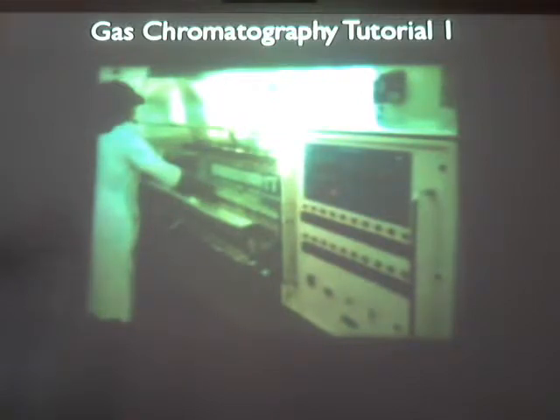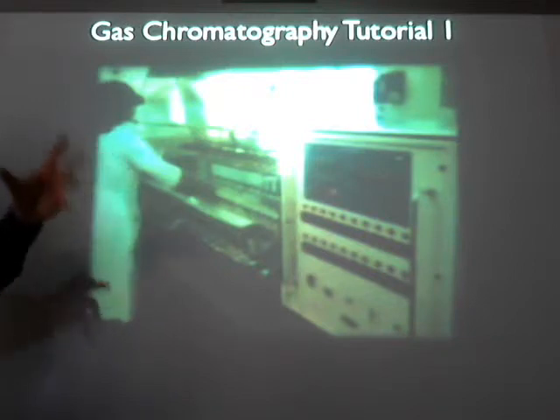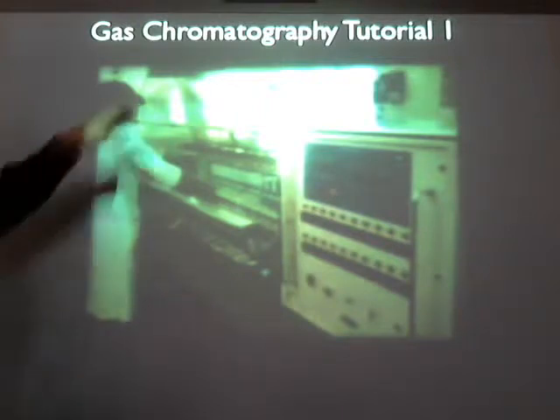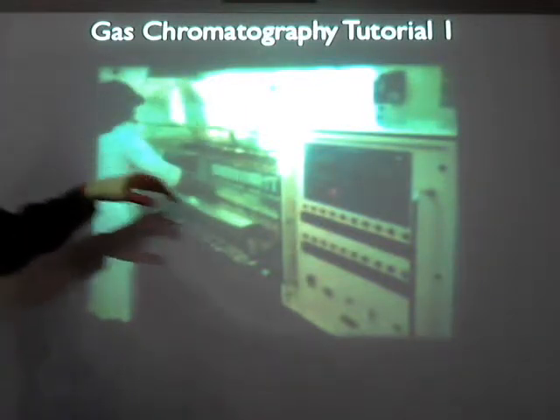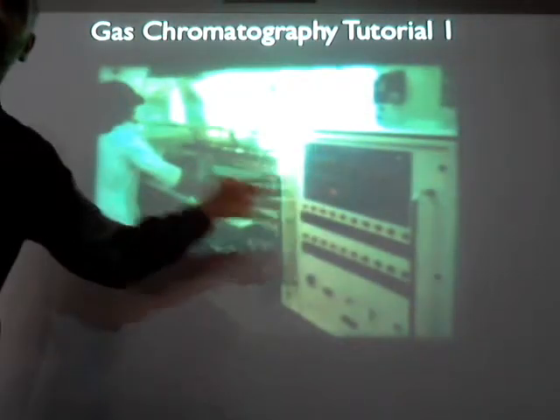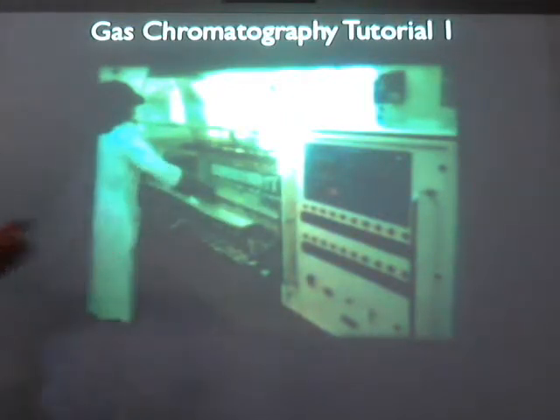Now, like I said, the quality of that one's poor, the next one's better, but that's actually a better description, that's why I put this one in here, of what's going on inside the machine. This one's going to be much better quality, you can see things better, but it doesn't really show you what's going on. That coil, okay, you're pushing with gas, usually helium gas, you're pushing this mixture through there, and as you saw, some of those components of the mixture are going to go through faster because they're lighter, and they don't have attraction to the column, and others will go through slower, and that's how you separate them out. But you can also identify them doing this, and you can also tell how much of it, percentage-wise, was in that sample. And that'll be illustrated in this next one as well.